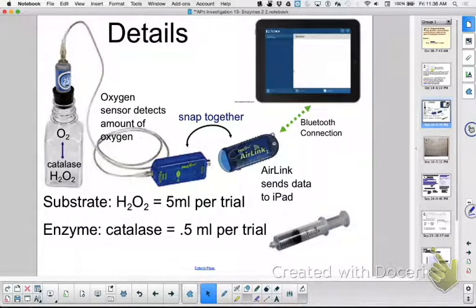Now, before I put in my enzyme, okay, and by the way, your enzyme is labeled here. It says catalase on here, and you have a syringe that stays in here. Don't put it on the counter so it won't contaminate anything, won't pick anything up. Before I put that in here, I need to set all of my probeware up, and I'm going to show you how to do that, okay?